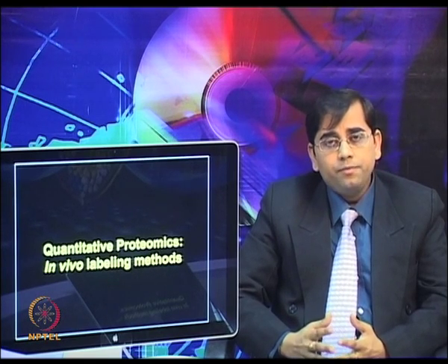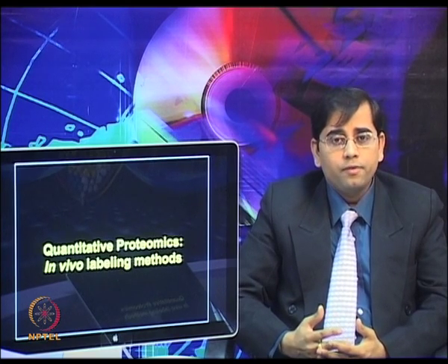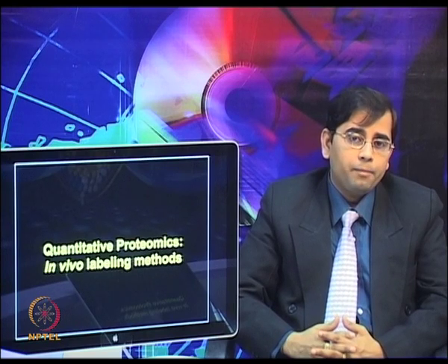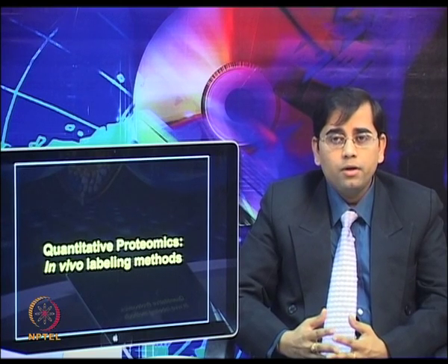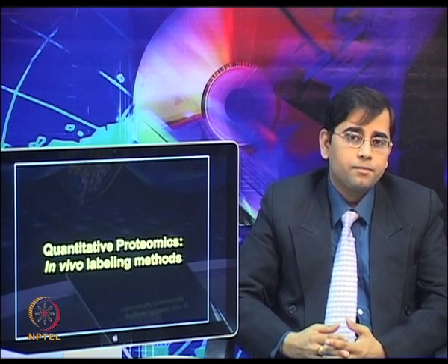For comparative and quantitative proteomic analysis, the development of stable isotope tagging methods allows the quantification of relative levels of proteins.